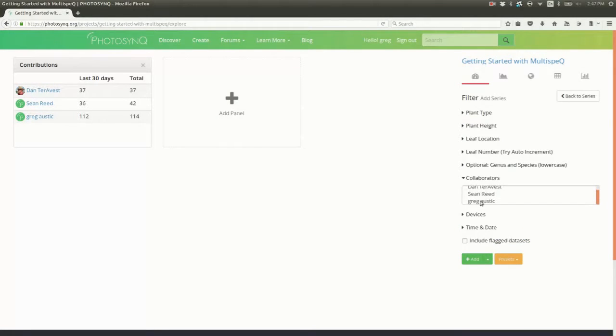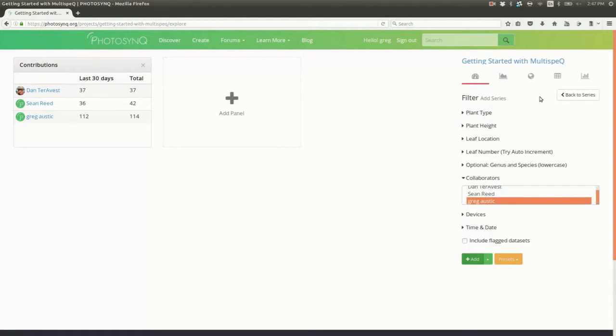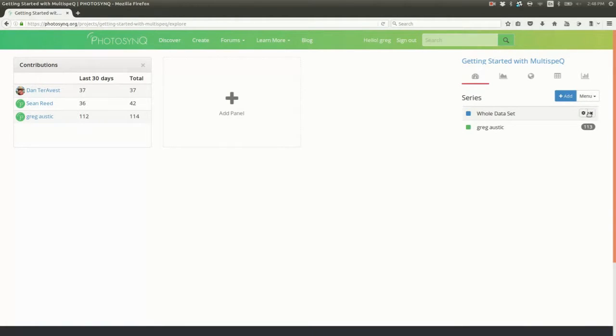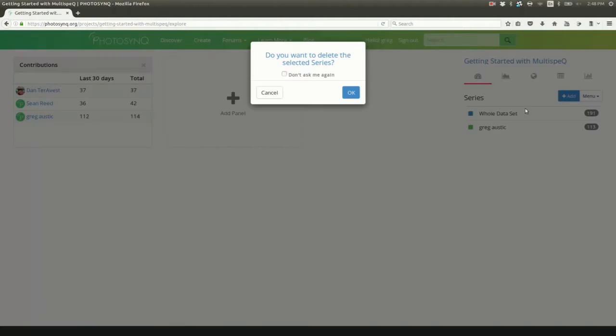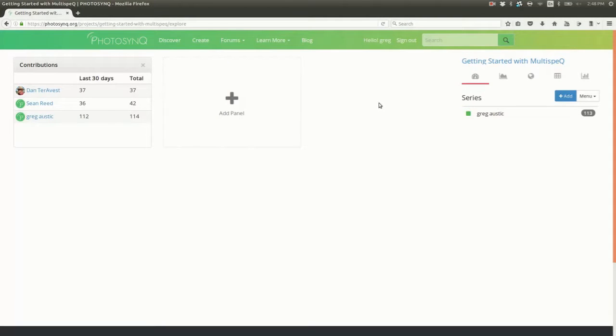Delete the whole data set series. Don't worry, we never ever actually delete data. We're just deleting it from this particular session. Now, back to series.